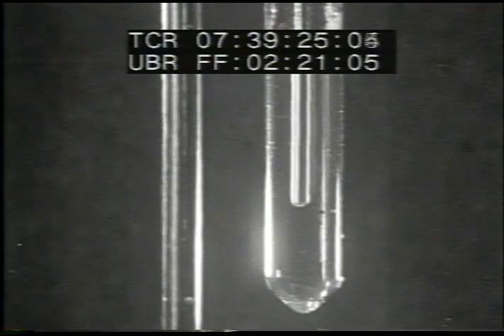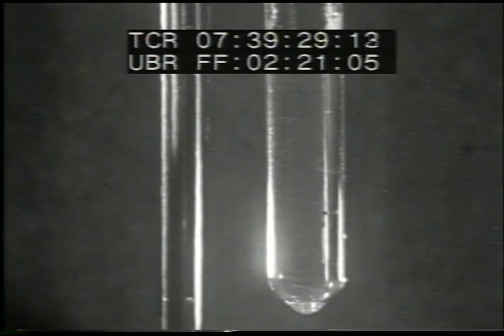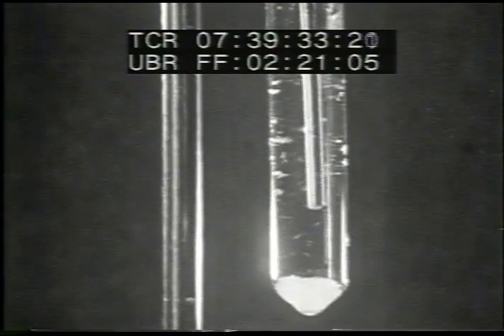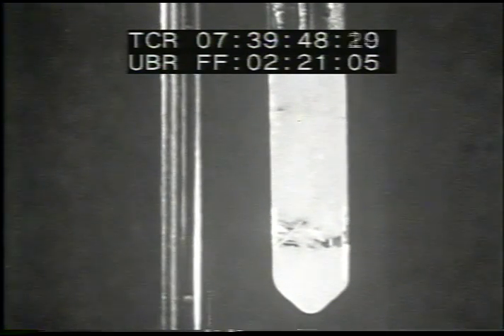Not all compounds react in this way. For example, if we drop a small seed crystal into this solution of sodium thiosulfate, crystallization takes place immediately. When crystallization once starts, it continues until the solvent is once more merely saturated. There is a decided increase in temperature during this process of crystallization.